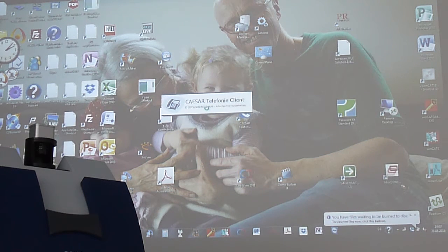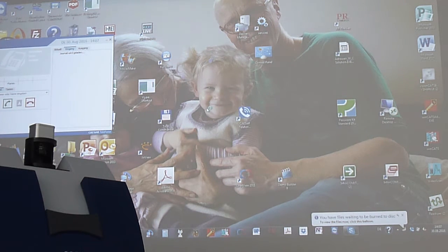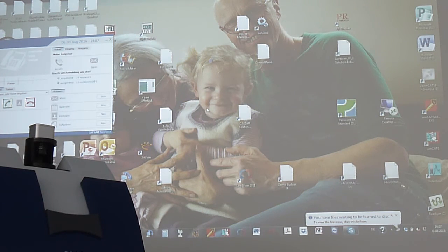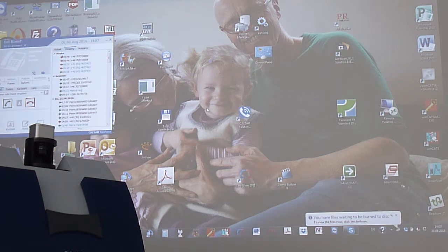So this is really something that, if you are at the customer side and you have troubles and you have somehow access to internet, is always the task. Last week I was with a customer in Germany, and their system was completely shielded from outside. The USBs were disconnected, it was a closed network, no internet, I couldn't download anything. Luckily, the only thing they forgot, I think, was the CD.